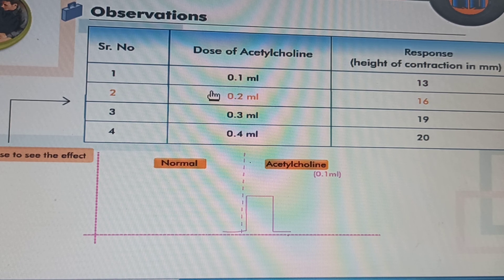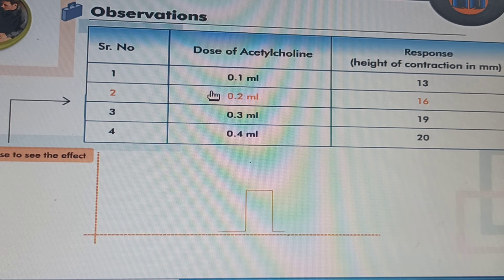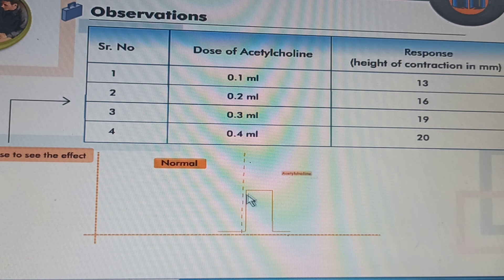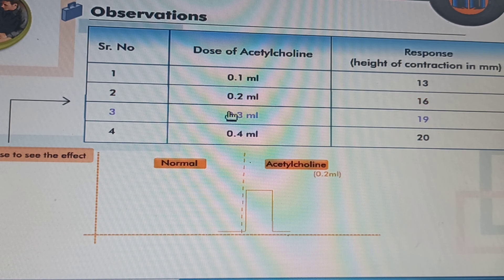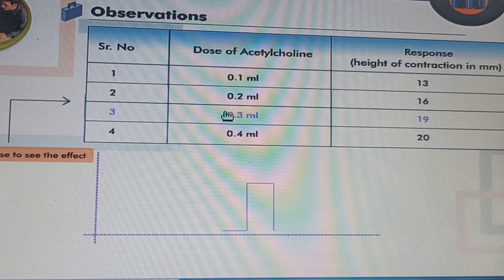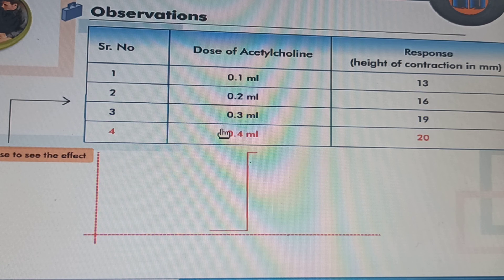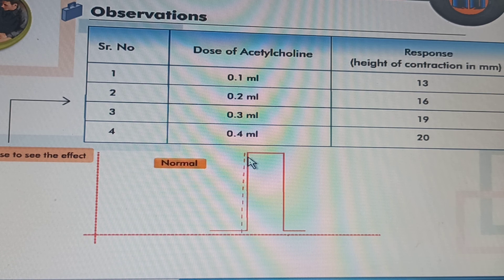When we administered the dose of 0.2 ml, we can observe that the height of contraction is increased, and it is 16 mm. Similarly, when we administered 0.3 ml, contraction of the muscle is increased further. And at the dose of 0.4 ml, the height of contraction is 20 mm.